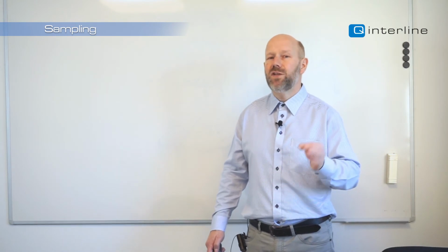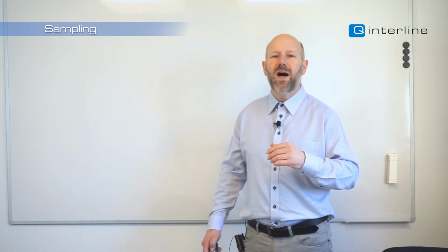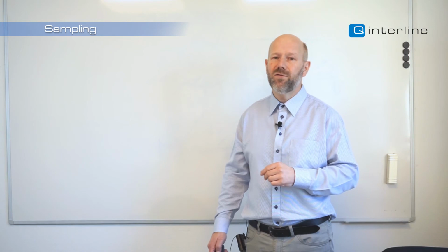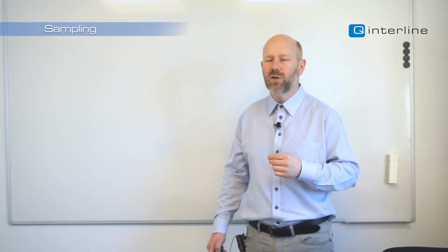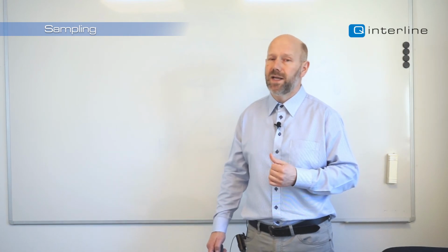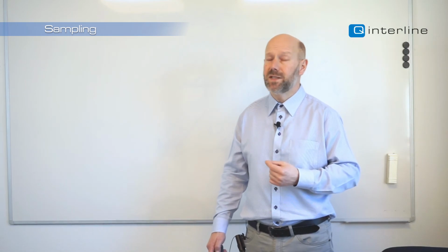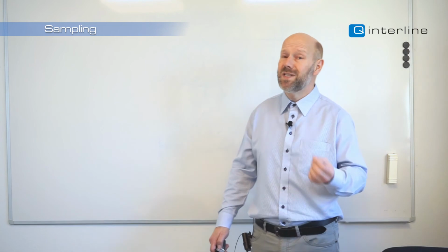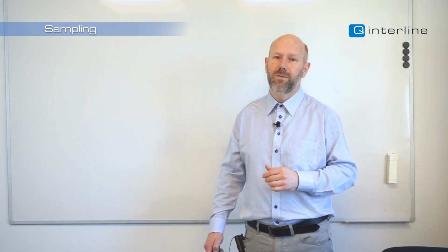So I would say, generally speaking, 5, 10, 15, 20 seconds is normally enough, but you may as well do it as quick as possible. There is no feeling good. If it has taken a round, you have taken a round, and that's all you can get. If you want to do more, you have to take 2 rounds because you want to have the entire sample having the same scanning. Otherwise, we do delimitation errors in the scanning section of our work.